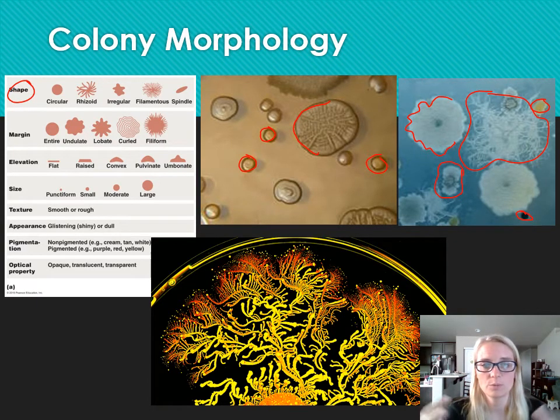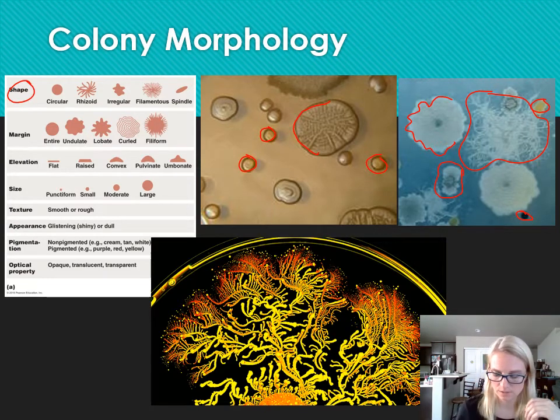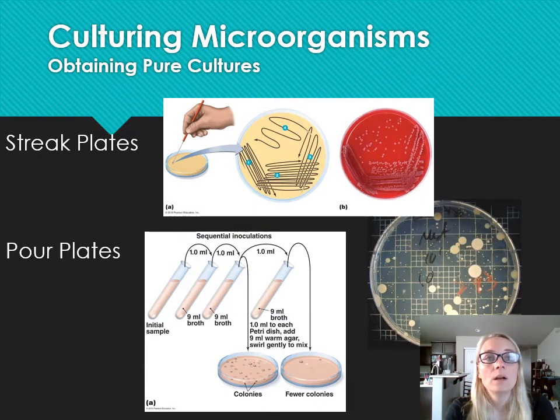It's all these descriptive terms to help describe what the bacteria look like when they're growing on the surface of an agar. It also helps you identify if you have any contaminants. If you're only trying to grow one type of bacteria and they're all nice white, circular, round, smooth margin bacteria, and then you get a big yellow splotch somewhere on your petri dish, that's a good clue that you have a contaminant, and leave that one alone if you want to focus on your organism of interest.